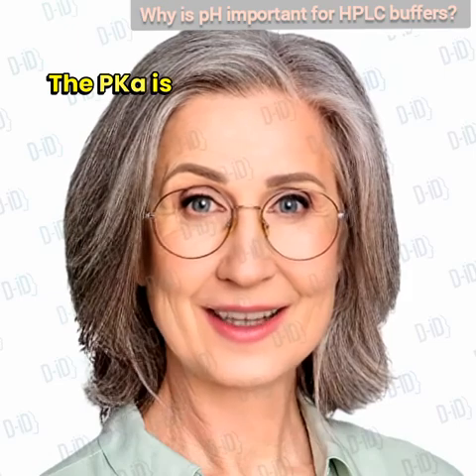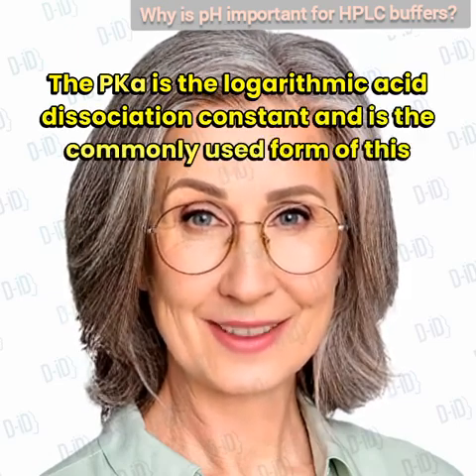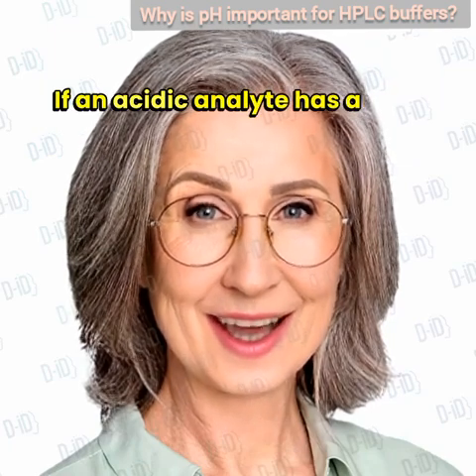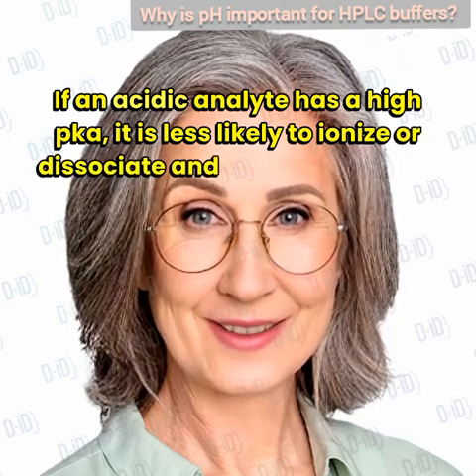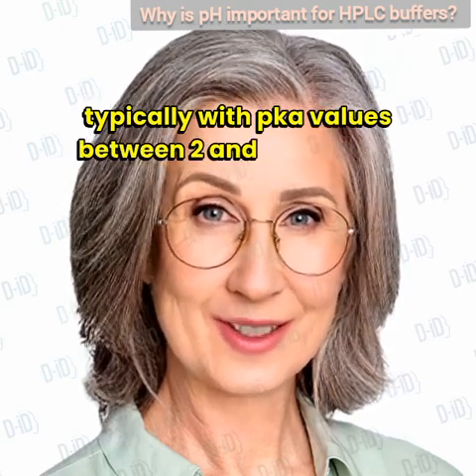The pKa is the logarithmic acid dissociation constant and is the commonly used form of this ionization constant. If an acidic analyte has a high pKa, it is less likely to ionize or dissociate and so is a weak acid, typically with pKa values between 2 and 12 in water.